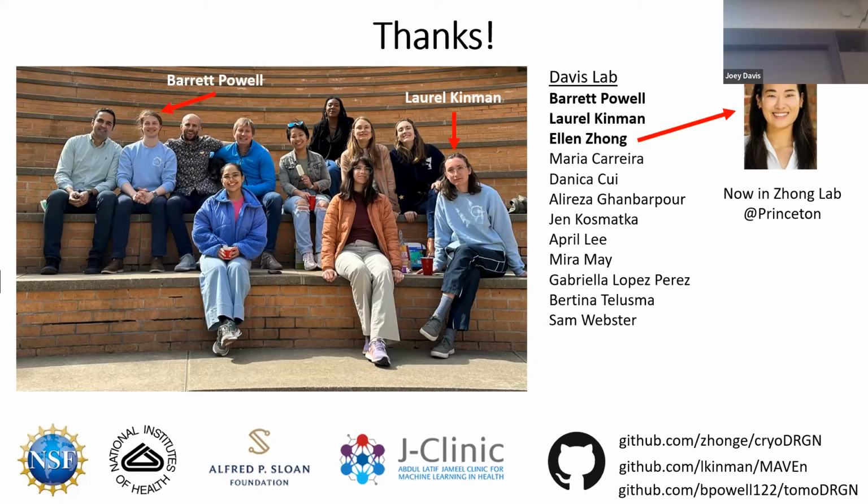I think the closest thing that comes to mind is this really nice workflow from Thermo Fisher and Basil Gerber's lab looking at a series of 24 small molecule inhibitors of some pharmacologically important target that's on the order of 100 kilodaltons, whose name I should know, but it is escaping me.